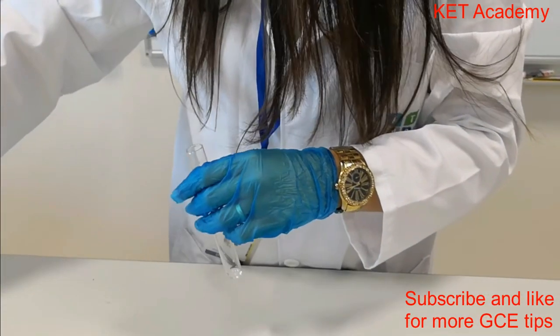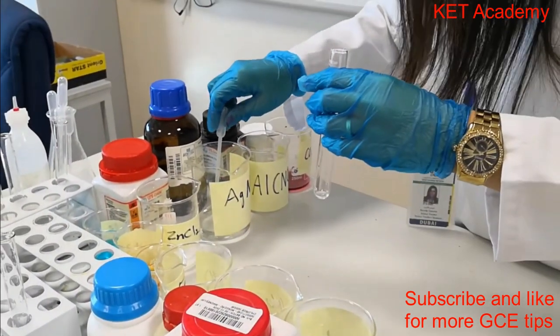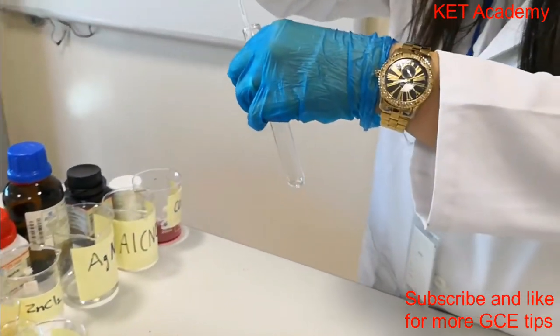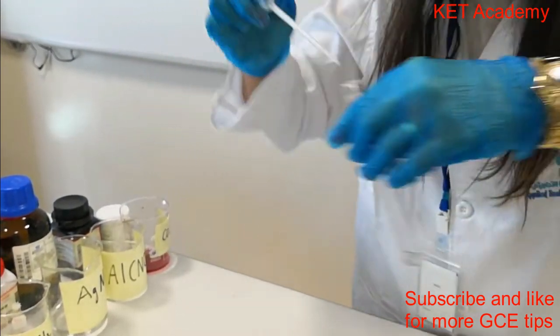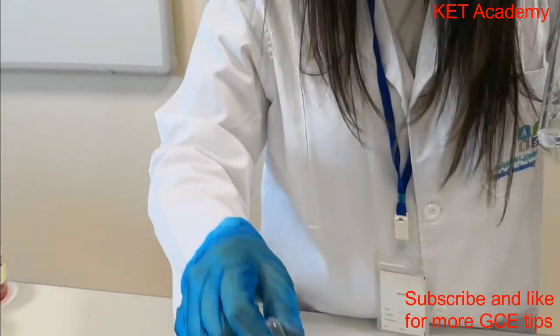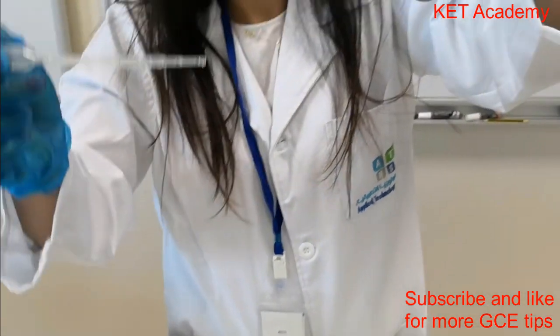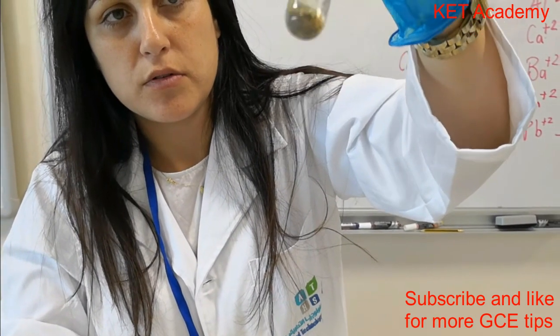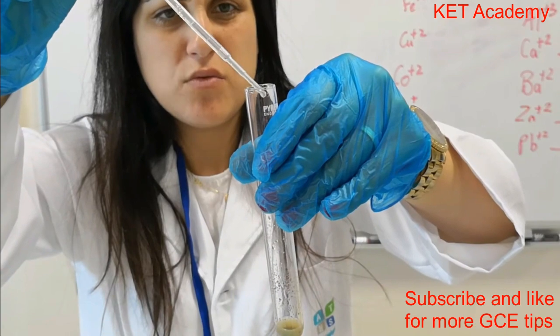Now we will try the silver. Solution of silver. This is silver, and we add to it sodium hydroxide. It turns brown to gray.